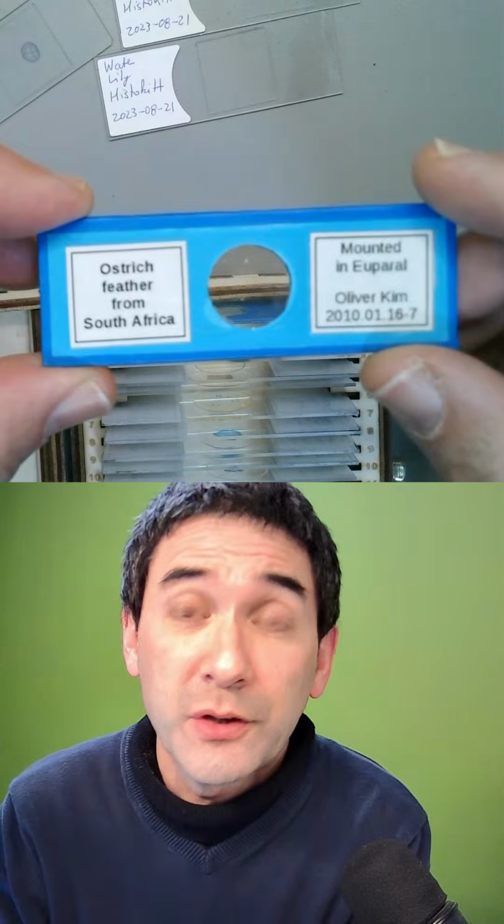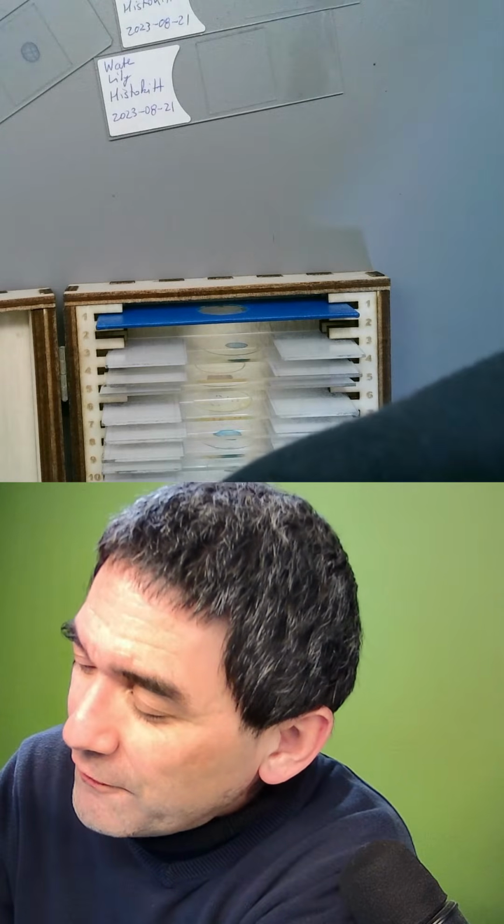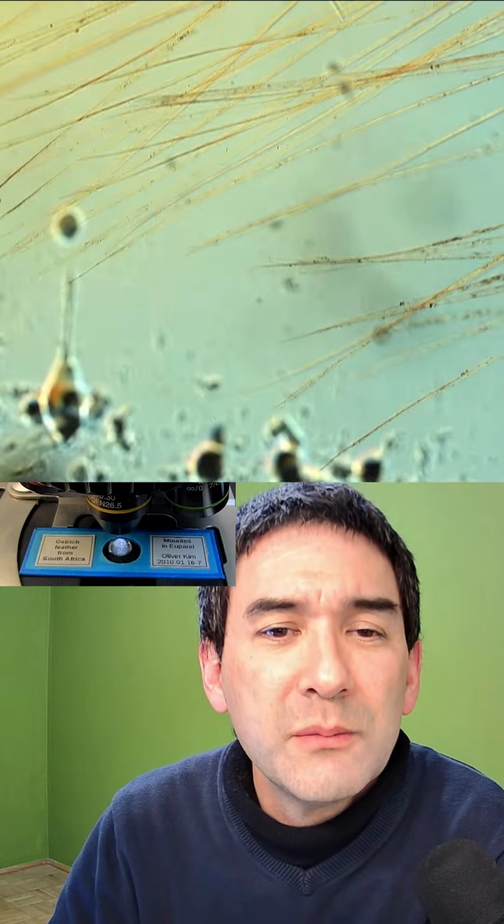I visited South Africa for an exchange program. This is a little souvenir from South Africa. It's the feather of an ostrich. And because I also would like to always check every now and then to see how well they have actually stood the test of time, because I always want to know whether they're still sufficiently stable. This is a little bit too. We see already there's some bubbles here.